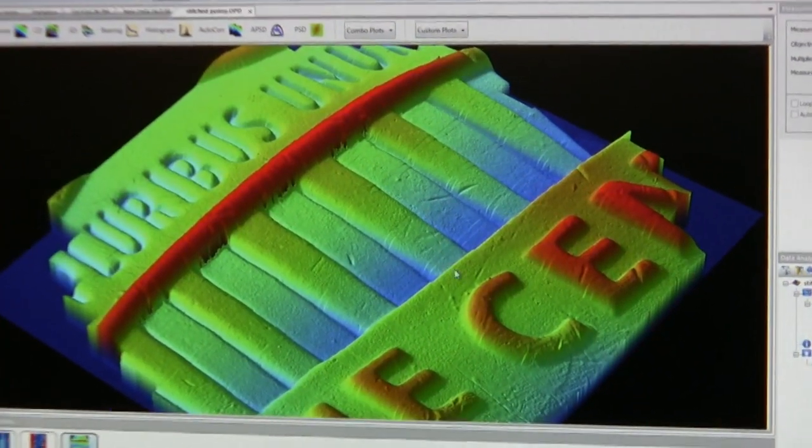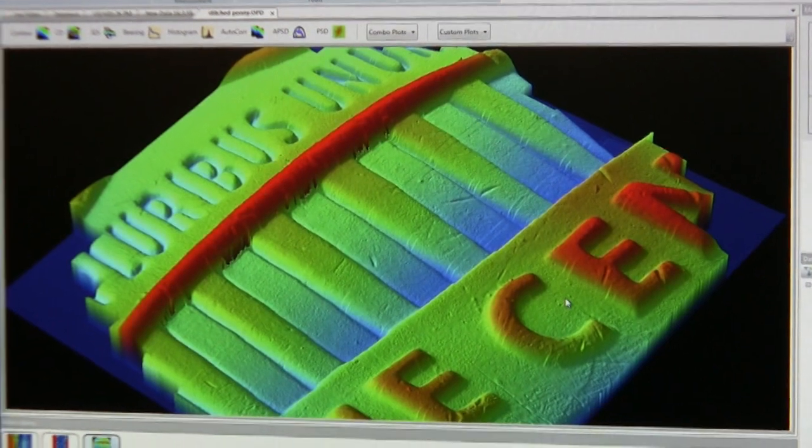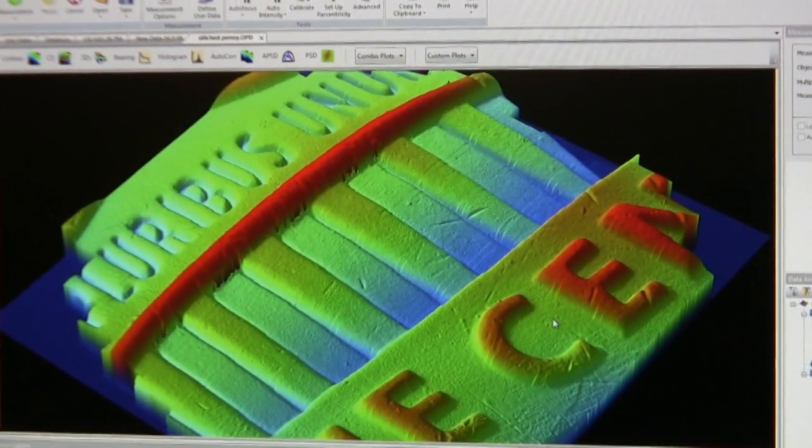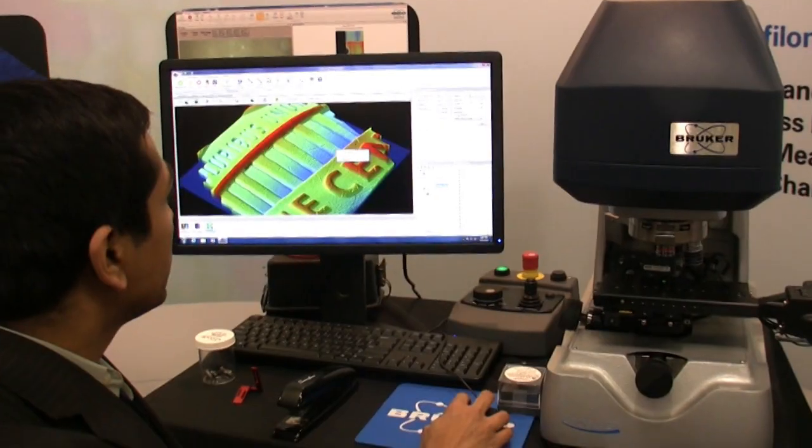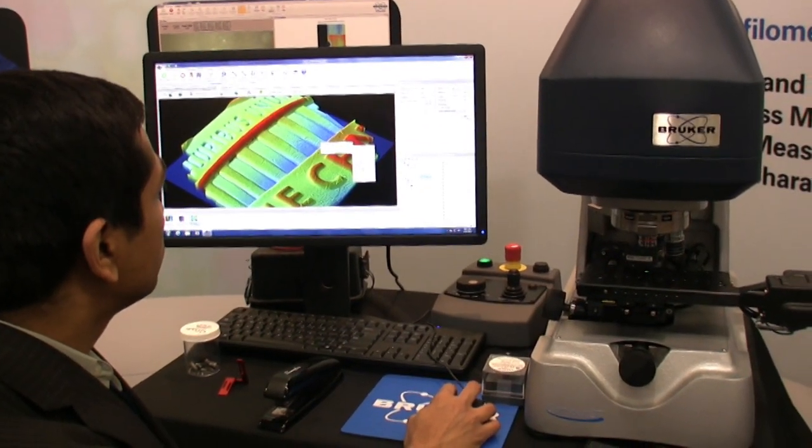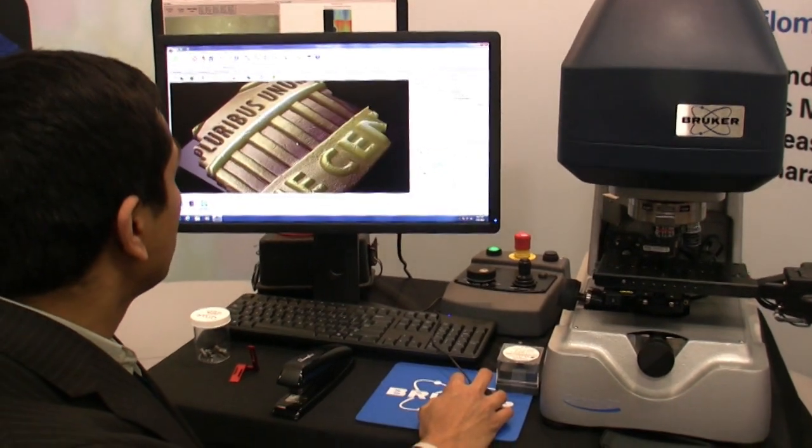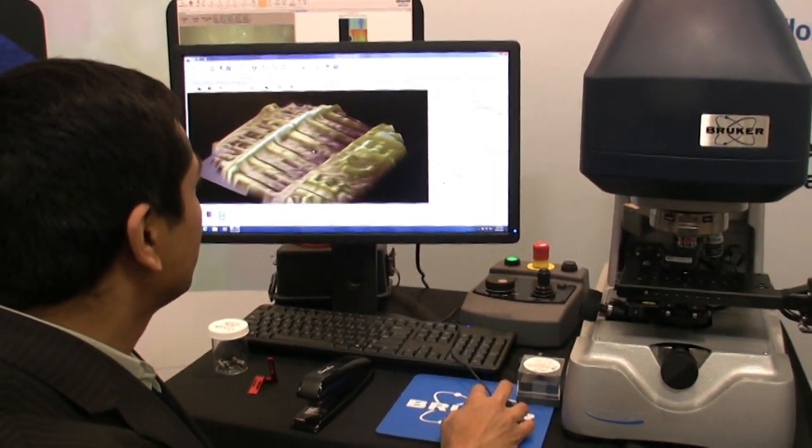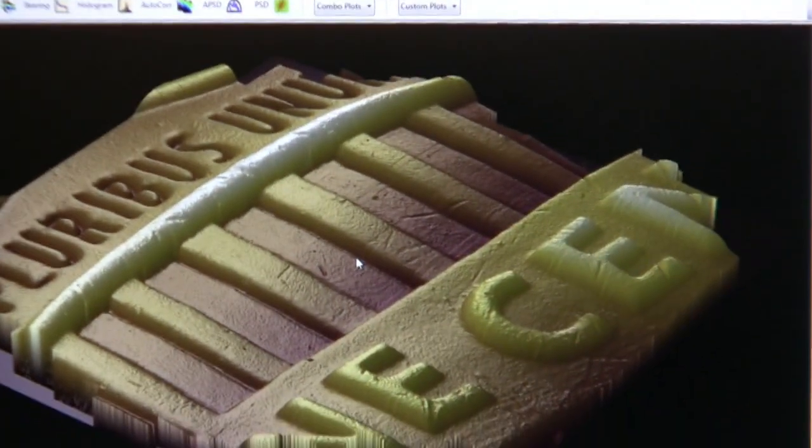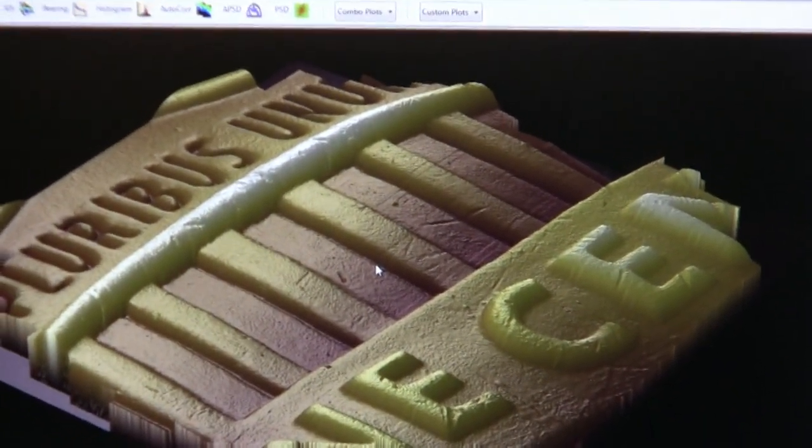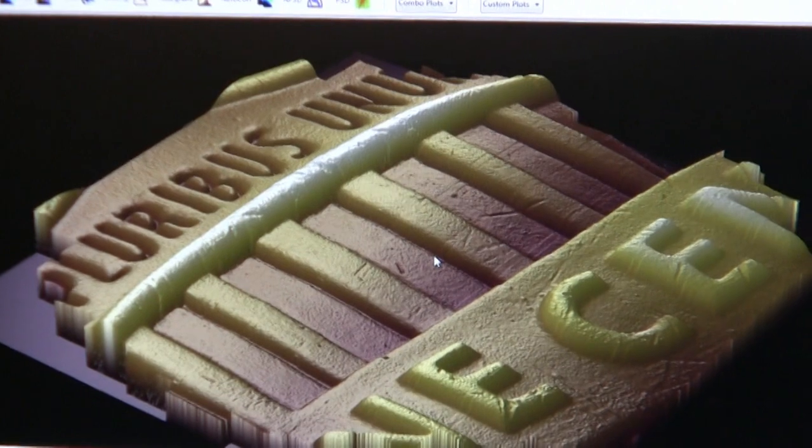You can zoom in on specific locations on the sample and continue to get very high resolution data. It's a very large data set with lots of information. You can change the color - the penny may look better in this color. It can look like copper, but the color is really a false color. The important information here is the three-dimensional topography that you can get from the surface.